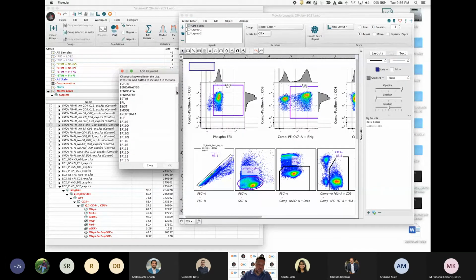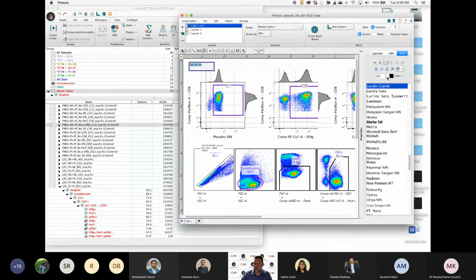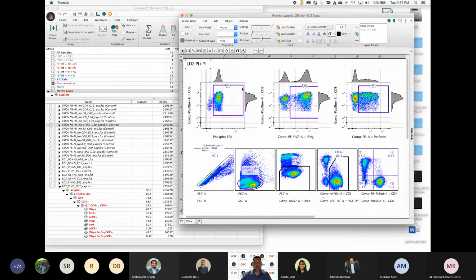Well, what's the easiest thing for me to see here? I want to look at the patient ID and the stim condition, so I can insert both of those as actual labels within the text box, make them big, go into my text options here and making them large. I can always use my object tab to remove the line or fill or anything that I don't want, so I'll remove no line. And what this is doing is making a label that says what patient and what stim condition I'm looking at and associating these visuals with those conditions.